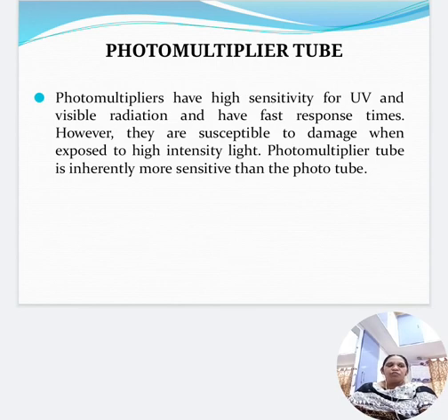The electron multiplier phototube, or photomultiplier tube, is a combination of a photoemissive cathode and an internal electron multiplying chain of dynodes. Popularly, there are two designs, the circular cage and inline configuration. When incident radiation ejects photoelectrons from the cathode, the emitted photoelectrons are focused by an electrostatic field and accelerated towards the first dynode.